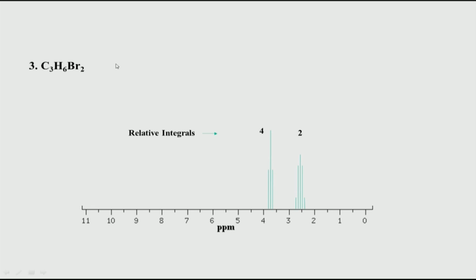In this case now we have a halogen compound. So, now let us look at this spectrum here. What do we see? We see a triplet and a quintet. These are 5 peaks here, and you can see 1 is to 4 is to 6 is to 4 is to 1 roughly in that particular ratio.